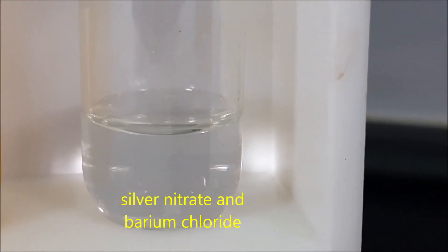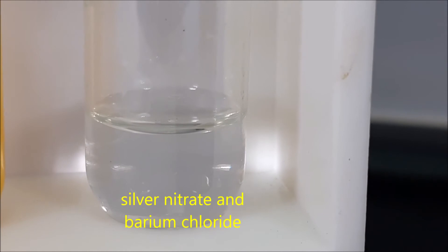For test tube number twelve, we have silver nitrate and potassium chloride.